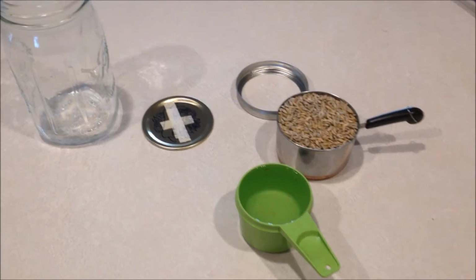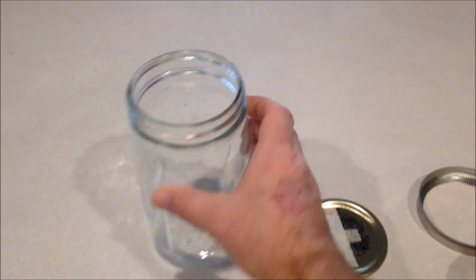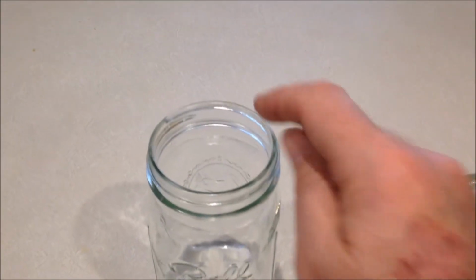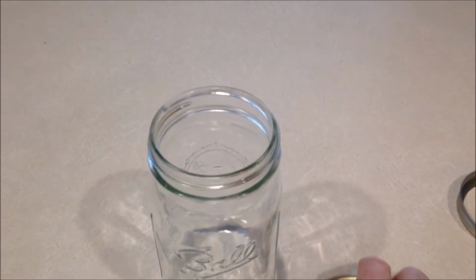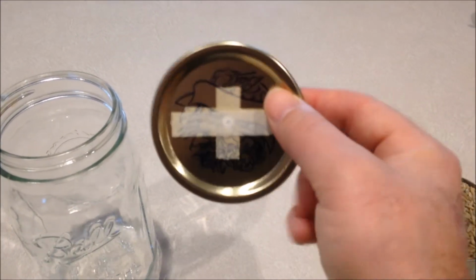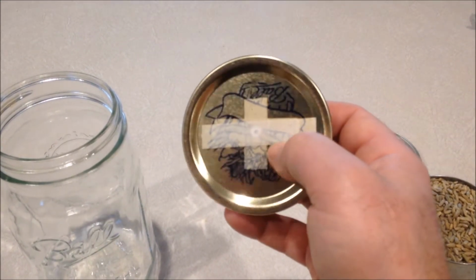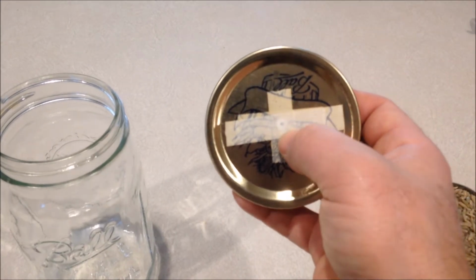And here's everything we're going to need to make our grain spawn jars. I use the wide mouth jars because once the grain colonizes, it's easier to get it out of there. Sometimes that stuff is hard to break up and get out of the jars once it gets fully colonized. Here's my lid. I just drilled a hole and sealed that with poly micropore tape so it can breathe, but no contaminants can get in.